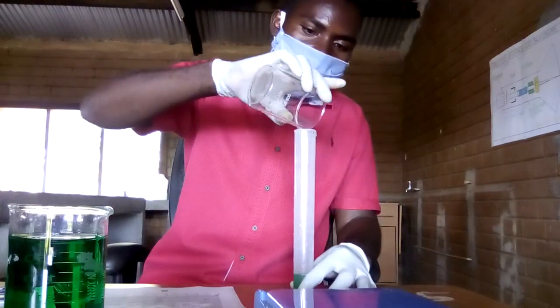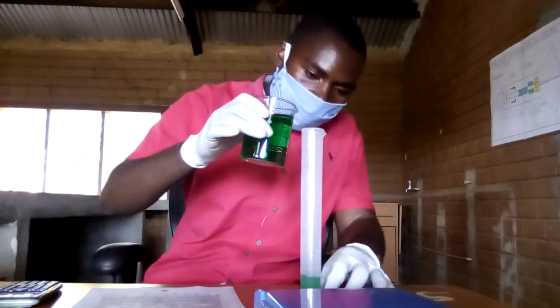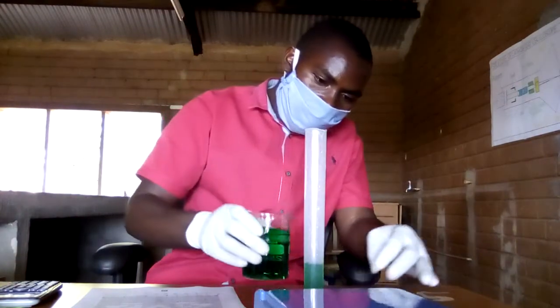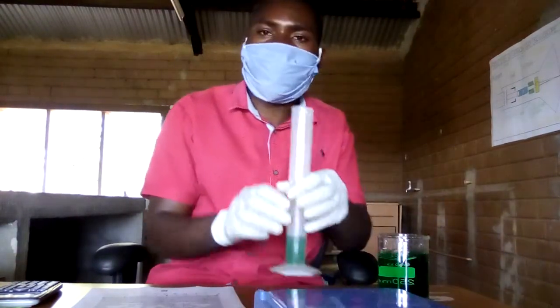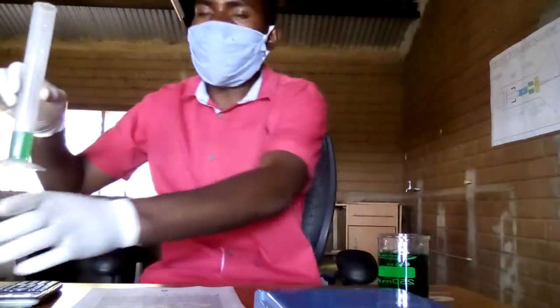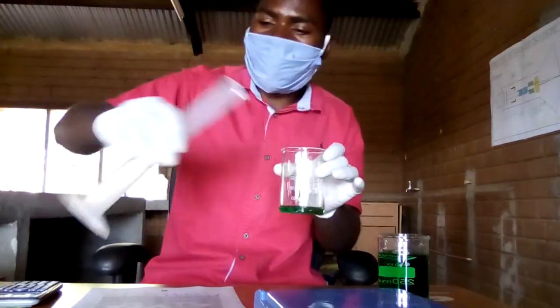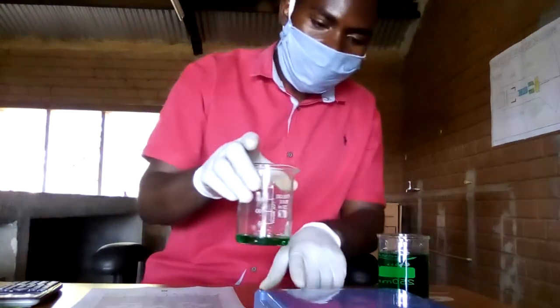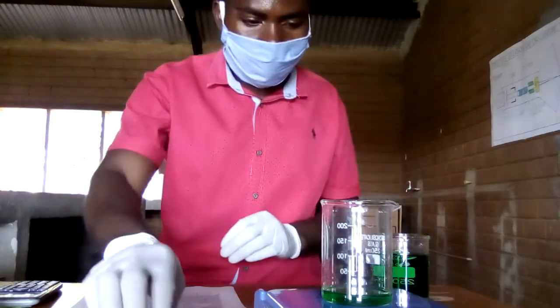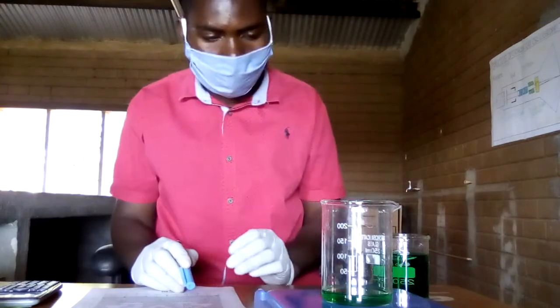Okay. Then the next thing I'll do is to again pour about 20 cubic centimeters of this liquid into the measuring cylinder, and this is exactly 20 cubic centimeters of liquid P. Once I do that, I need to pour it in the beaker, which is empty, and then I should measure the mass. So what I've gotten here is 122.1 grams.